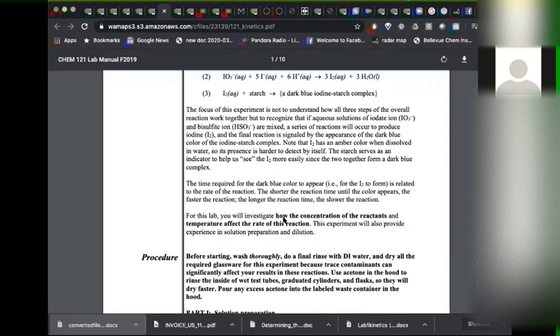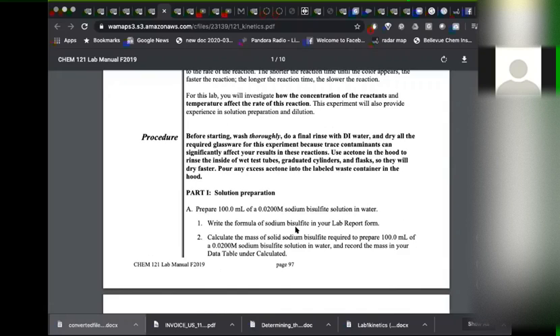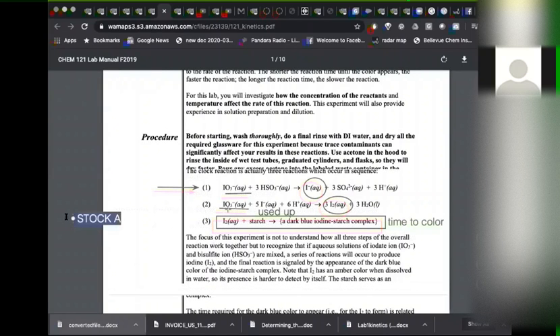We're going to check out how the concentration of the reactants affects the time, and we're going to take a look at how the temperature affects the time. So, in order to do this, we are going to make two solutions, our two stock solutions. Stock solution A, and then we have stock solution B. Those are our two solutions. One is the sodium bisulfite, and the other is potassium iodate.